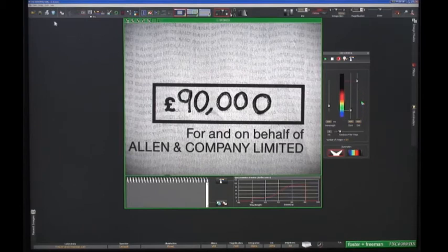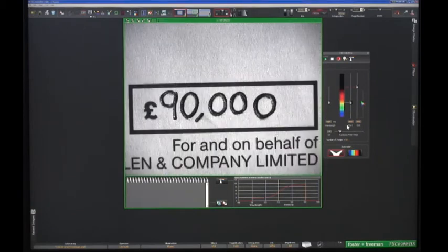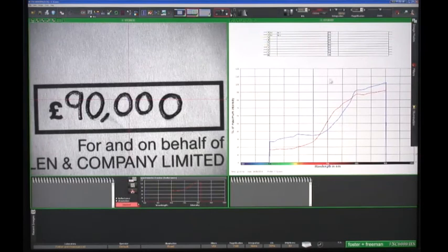We can recall a previously saved image cube by clicking this button. The start, end and step size sliders will automatically be updated. This is a recording made earlier of the same check, but over the range 602 to 816 nanometers. If we now look at the spectrometer, you will see that the spectrum is only displayed between these two wavelengths. All other wavelengths are shown as 0.